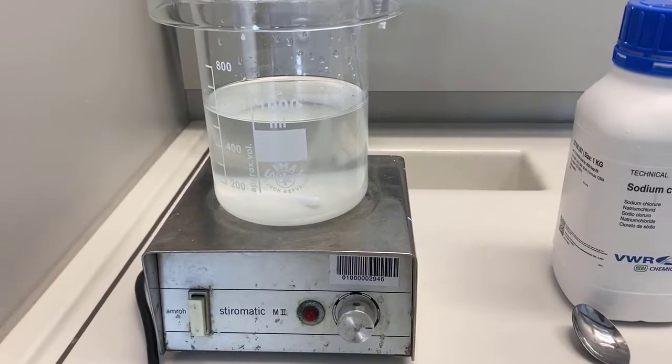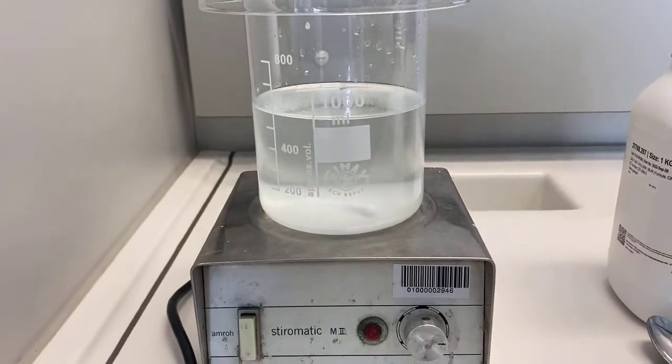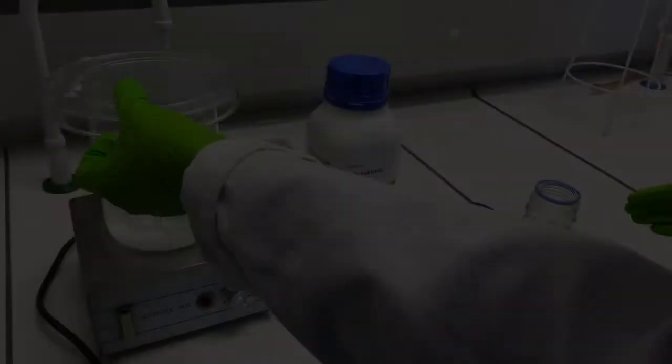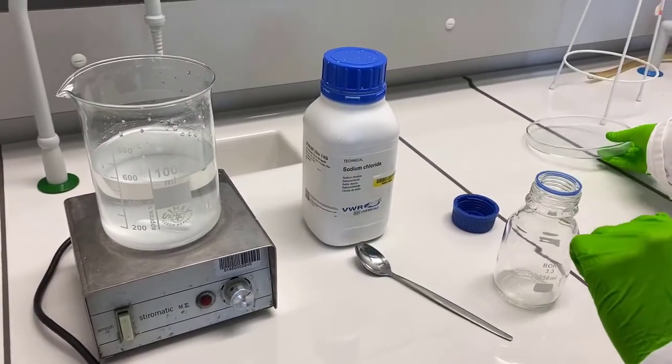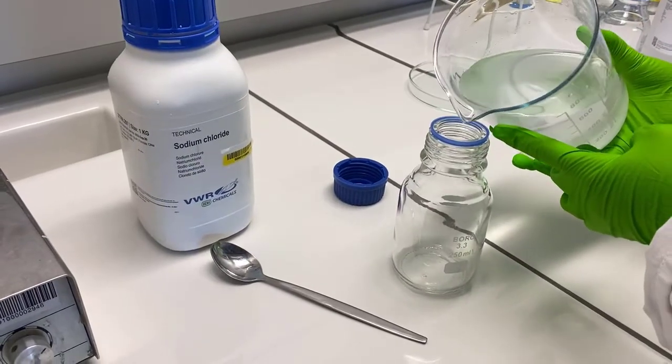Once the solution is saturated with sodium chloride, stop adding further salt and leave the solution overnight at room temperature. The next day decant the supernatant in a new container leaving behind any salt at the bottom.